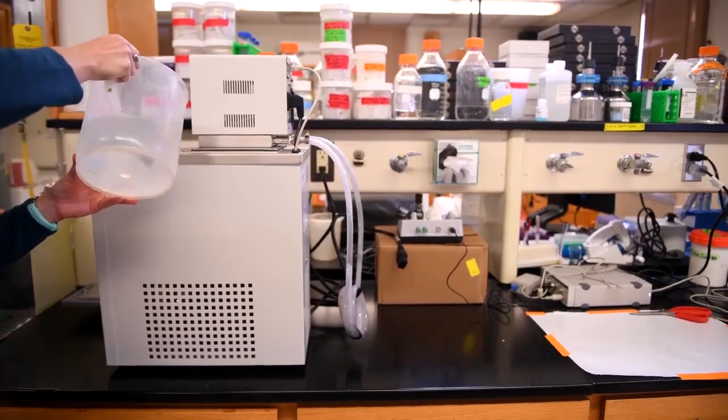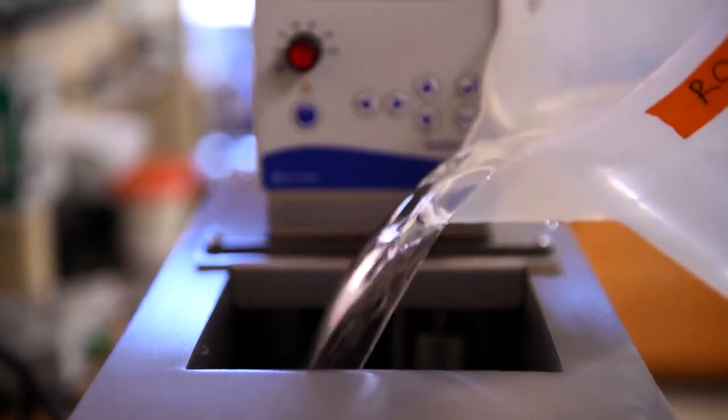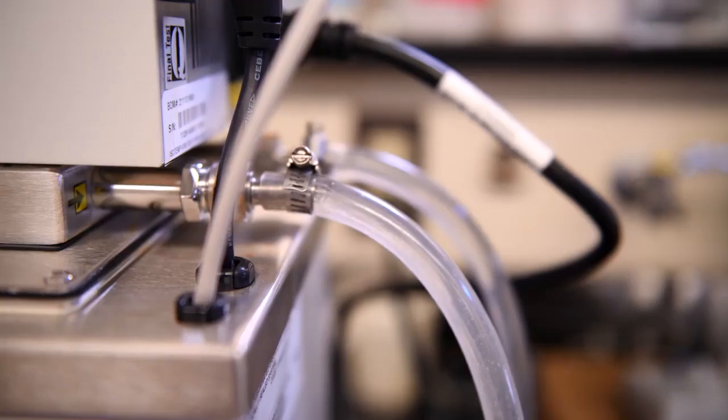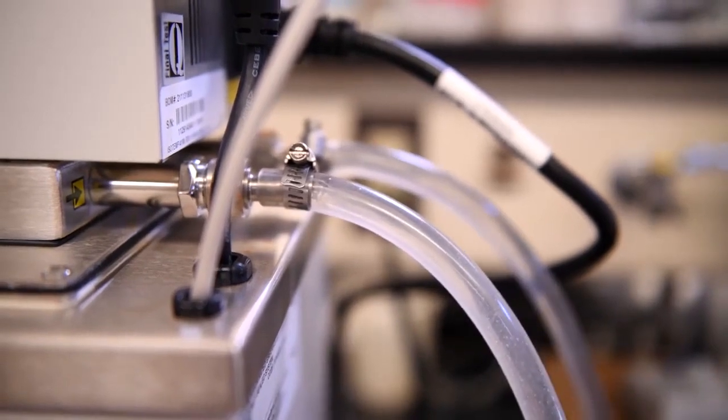Fill the well of the circulating water bath with reverse osmosis water and plug the power cord into an outlet. Turn the water bath on and make sure there are no leaks in its connection to the heat exchanging coil.